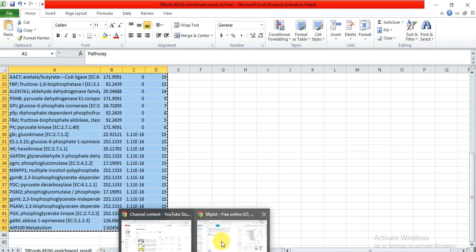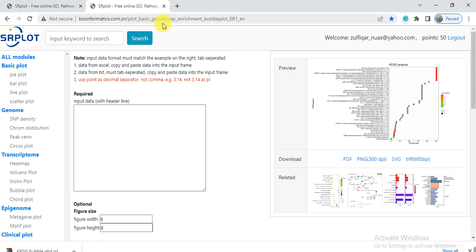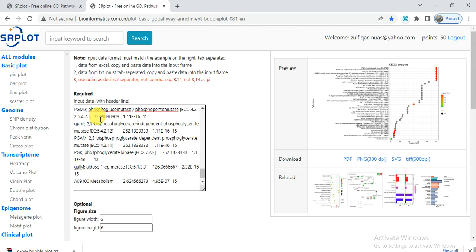Now select all these values and copy them. Open the browser and open the link bioinformatics.com.cn/plot_basic/GO_pathway_enrichment_bubble_plot. The link is also present in the video description. You can open it and go directly to this page.